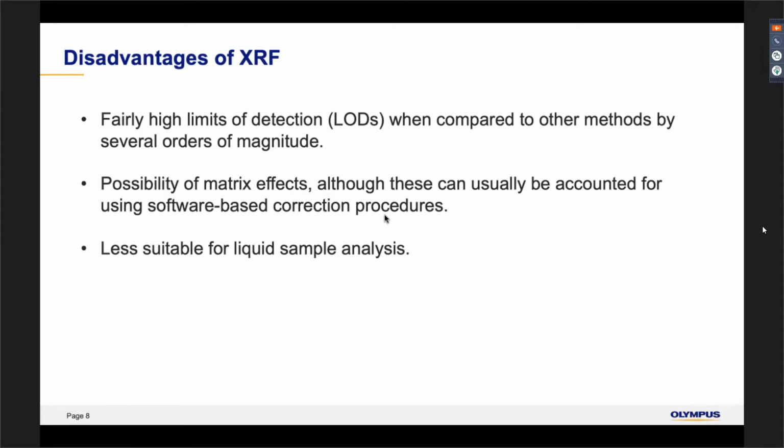So today, Prof. Chang will be sharing with you how we can make use of his method with the portable XRF to determine the heavy metal contents in wastewater, which we can easily pick up at ppb levels as well.